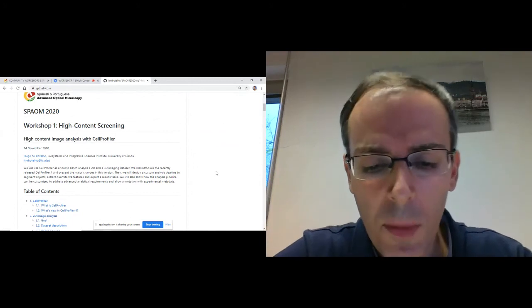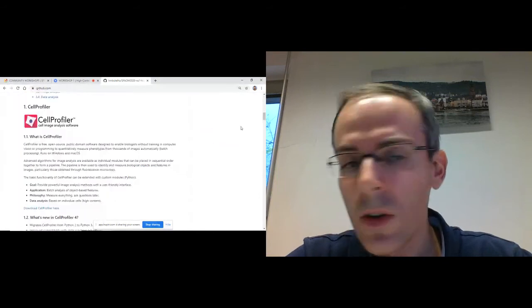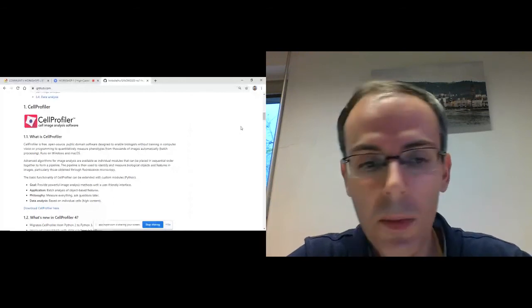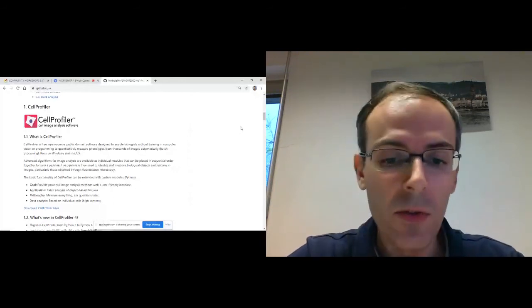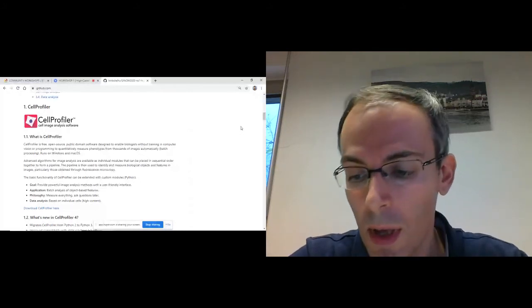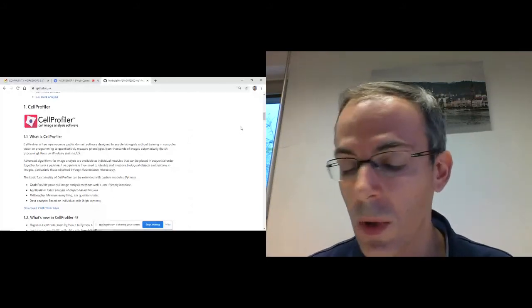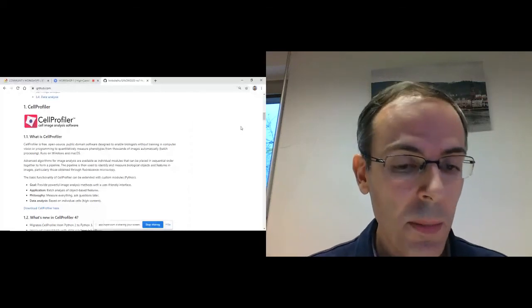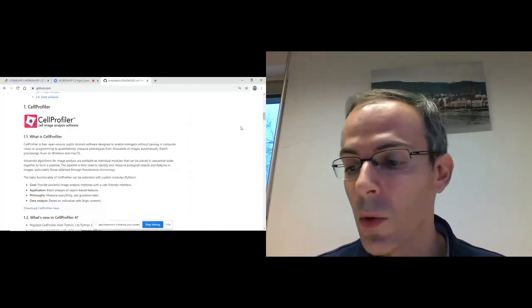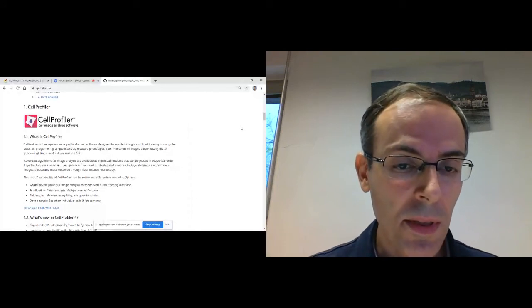So this is, of course, typically what you would do on a high content screening campaign, and in such scenarios, you may also want to extract this kind of image-based features on a per object basis, or characterize each cell, for instance, in your data set. This is done in CellProfiler with a so-called pipeline, and the pipeline is a combination of basic image analysis steps, which you can configure in a way to produce the quantification you need from your data set.